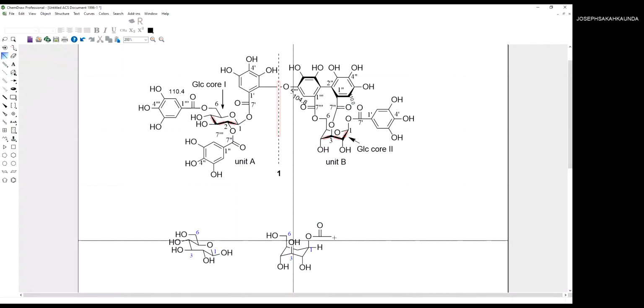But you know, in your mind, that if what is hiding on this side has got a proton, then probably that proton correlates with this carbon also. Already, the proton of glucose 1 has led us to this. But if you want to move from here to the next, then it's like doing reverse. Then you assume, you know that there is something here.